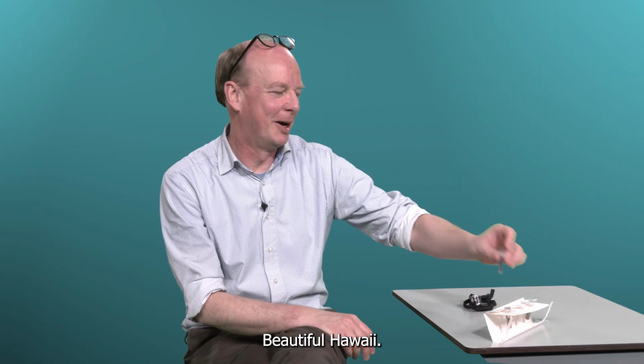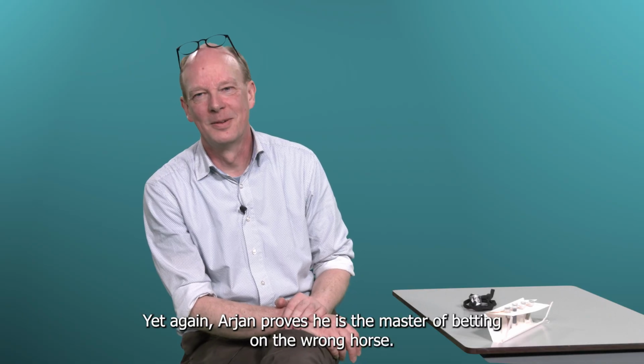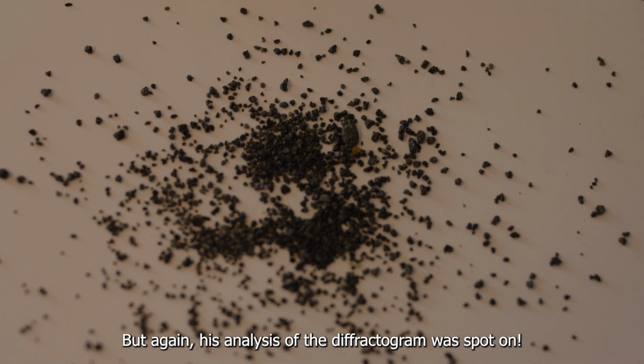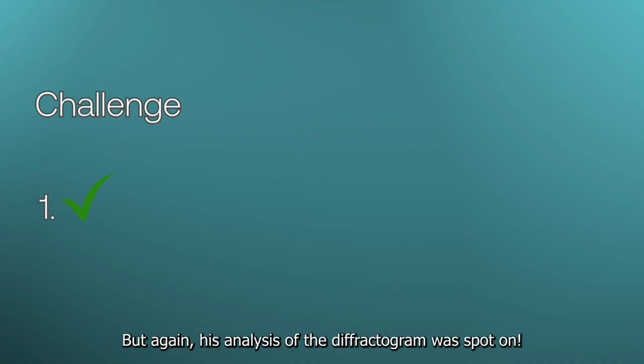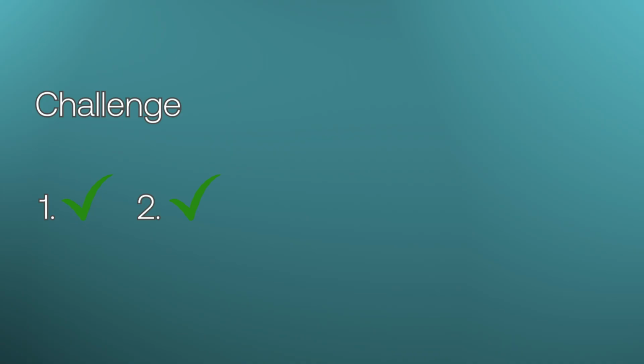Yeah. Beautiful Hawaii. Yet again, Arjan proves he's the master of betting on the wrong horse. He mentioned Hawaii, but picked Tenerife. But again, his analysis of the diffractogram was spot on. I reckon we should award him this challenge too.